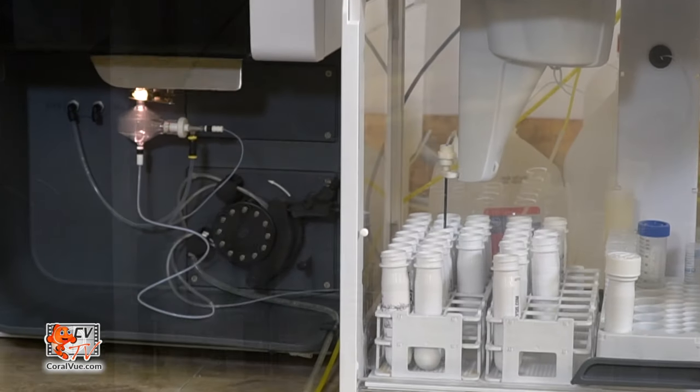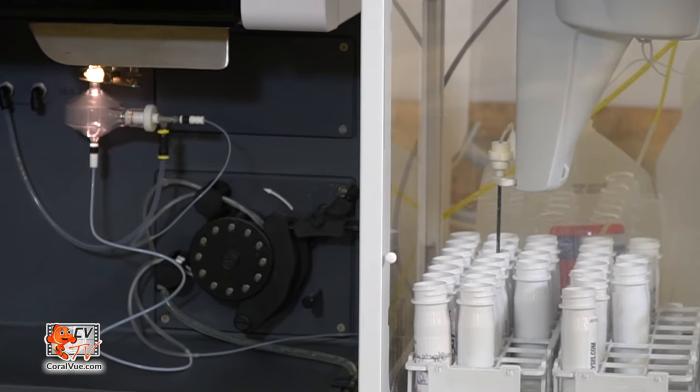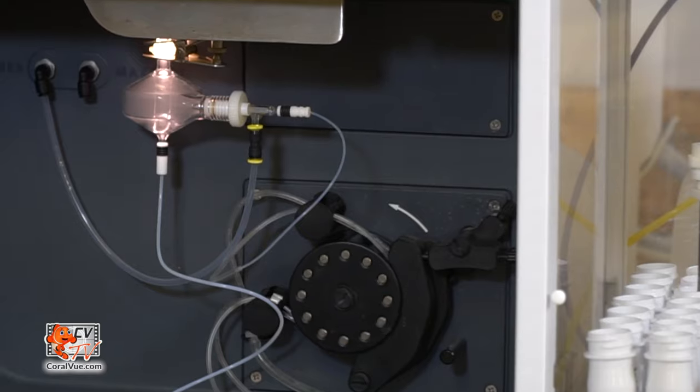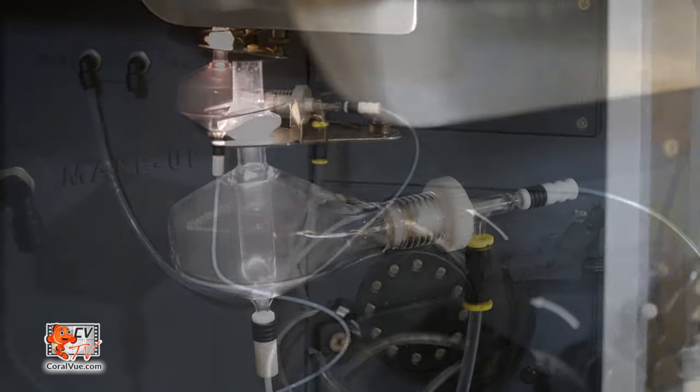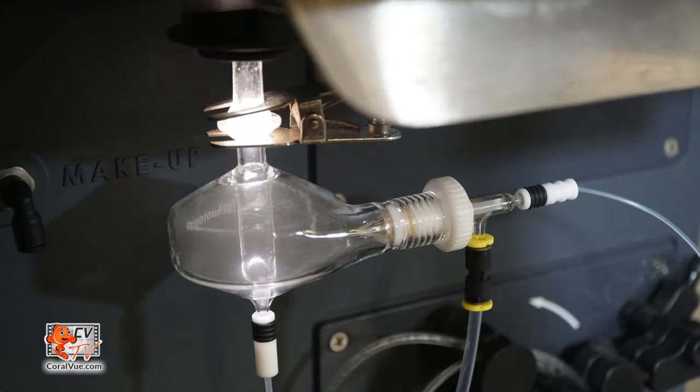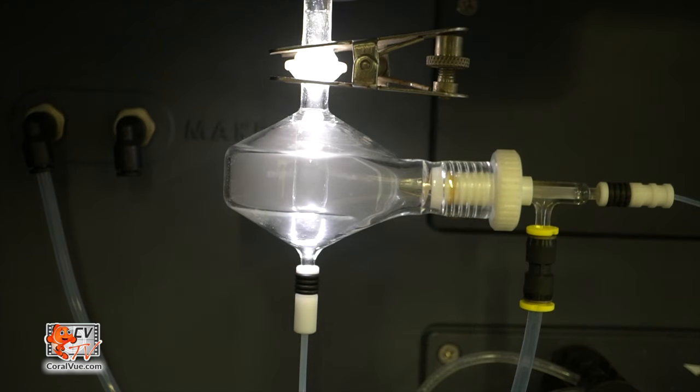Using a peristaltic pump, the water sample then makes its way from the auto-sampler into the nebulizer. The nebulizer turns the water sample into a mist of tiny droplets that can be easily introduced into the torch.